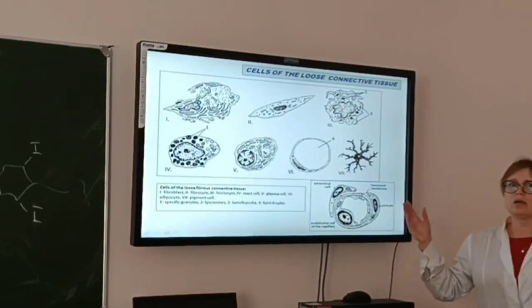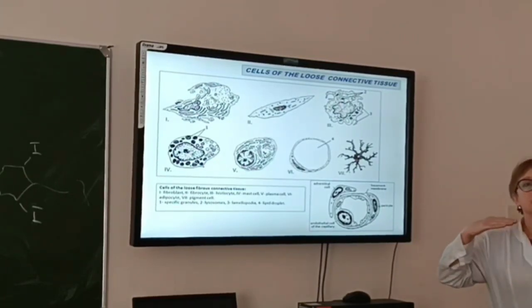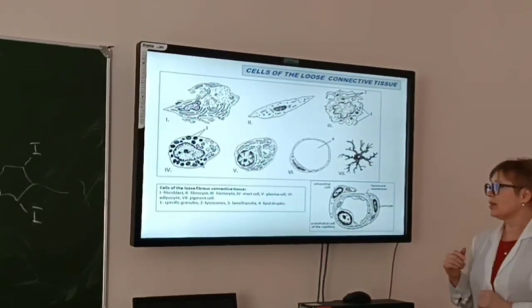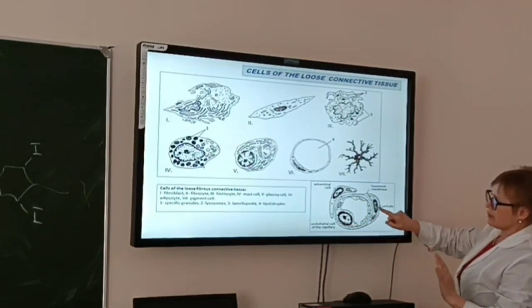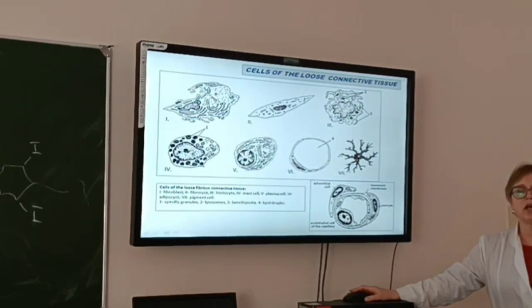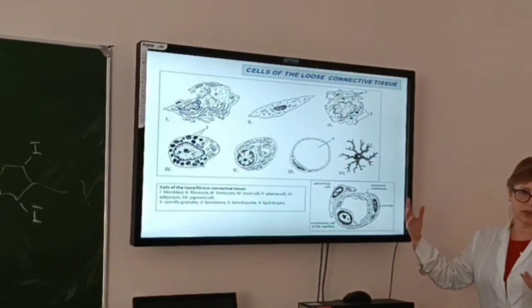So, endothelium: flattened cells that lie on the basement membrane and are in contact with each other by junctions, which remind us of what type of epithelium? Or what type of tissue? Epithelium. Yes. The capillary consists of these two main components. Plus, from time to time, in a duplication of the basement membrane, we can find pericytes. Pericytes we can consider cambial elements; this cell can divide and give rise to a new endothelial cell, for example.